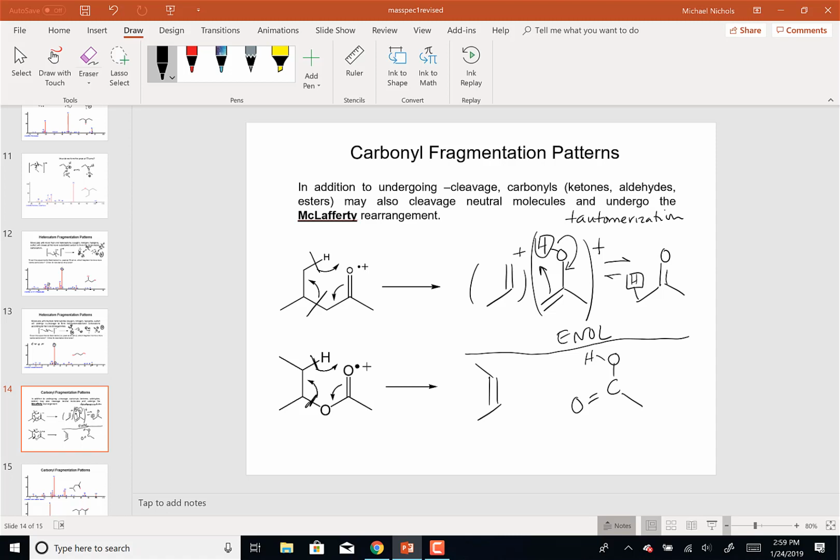Make sure that if a tertiary can be drawn, that takes precedence over secondary. It would ask for resonance structures. We've got a couple types of resonance structures: the alpha, the heteroatom resonance structure, and we also have the allyl resonance structure. So that's what I'm asking for.